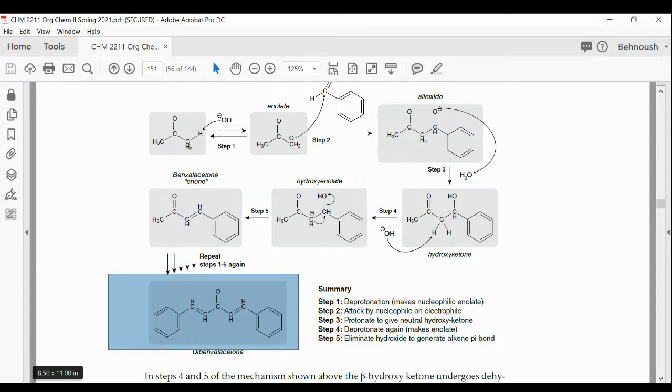That means that it's really getting close to the baseline. And I will show you the peak for the CO double bond for the product from the IR spectrum today, that it will pass the 50%. So it's basically touching the baseline. That means it's a strong peak. A weak peak is a short peak in this case for IR. Okay, perfect, a strong peak, very good.